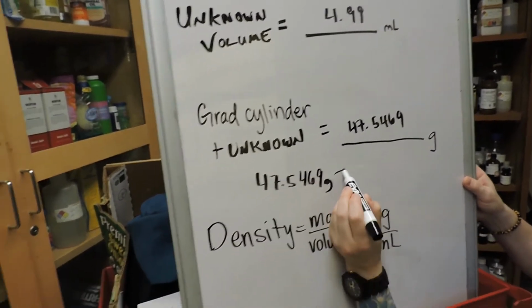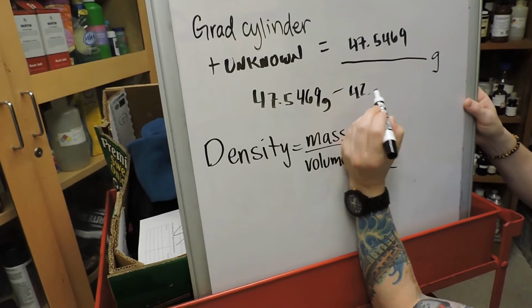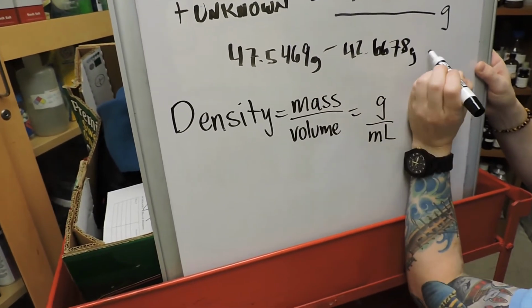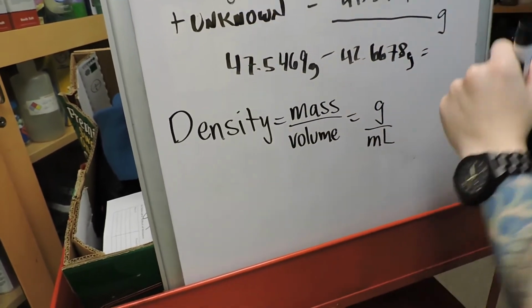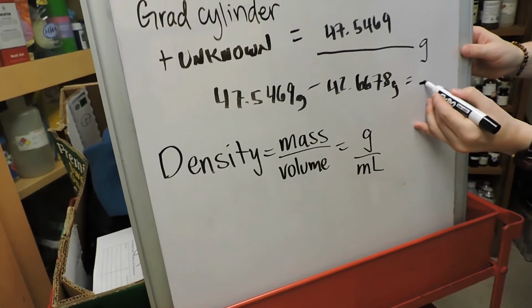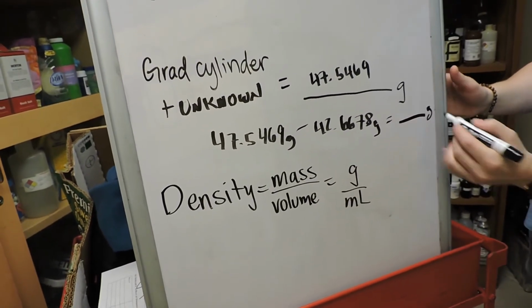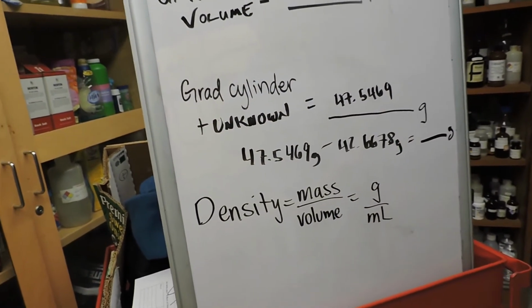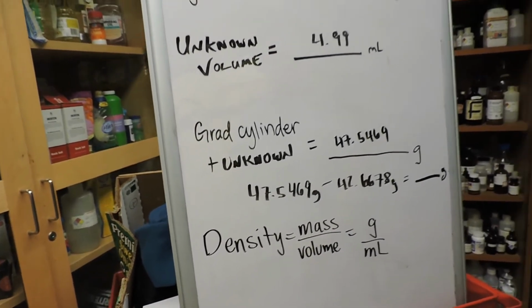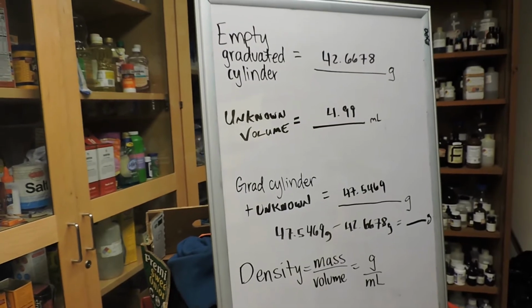You can then calculate the density of this liquid by dividing the mass by the volume. So the units for this measurement will be grams per milliliter. Then you can compare the value that you obtained for the density with the values in your manual to identify the unknown liquid that you used in the experiment.